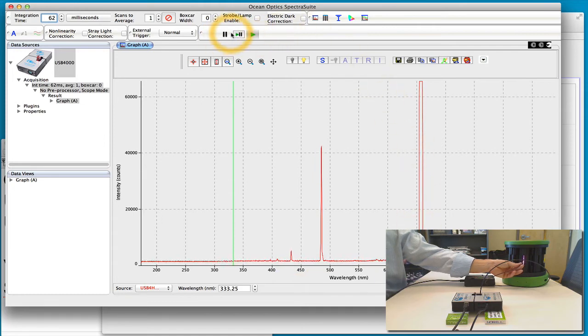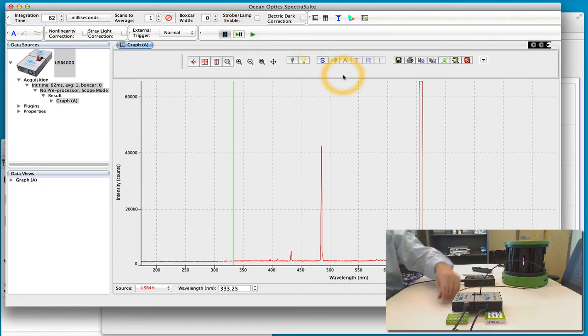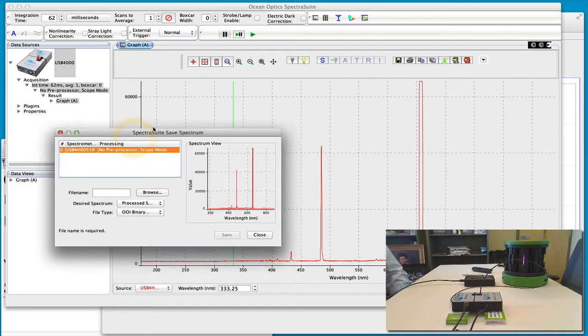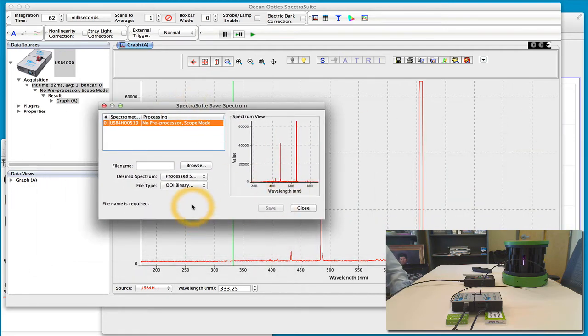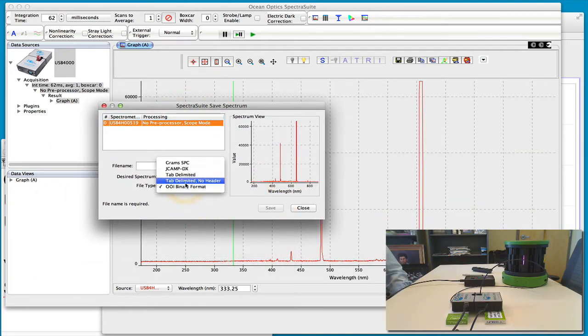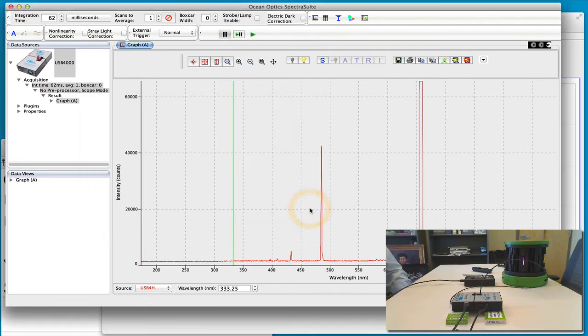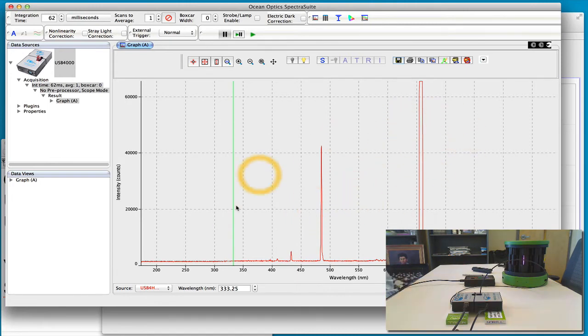We can stop that, pause that, we can save that spectrum and we can save it as either a binary file or a tab delimited text file with or without headers. And so I've already done that and posted some of these to yardorside.com with downloads of some of the different emission spectra.